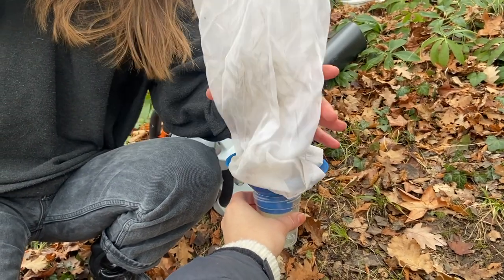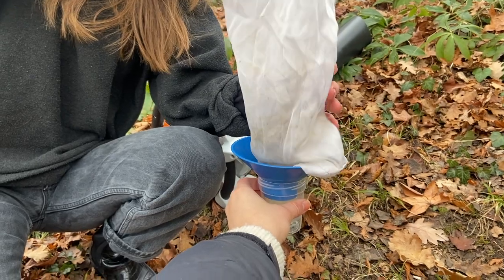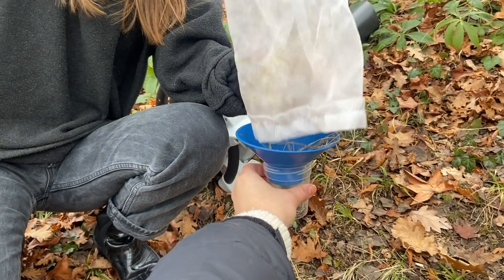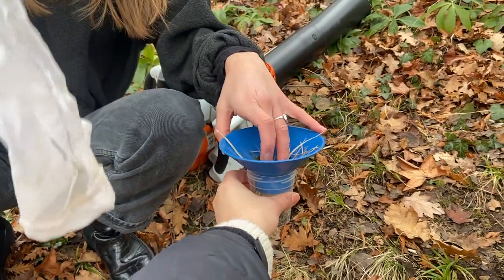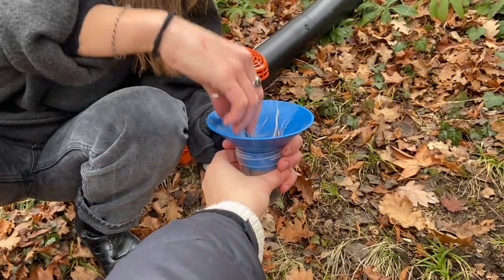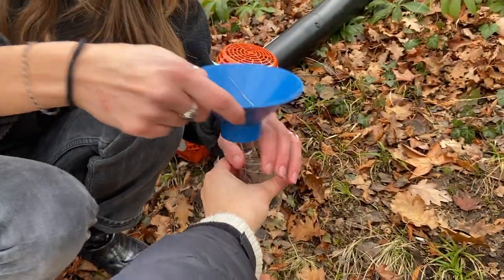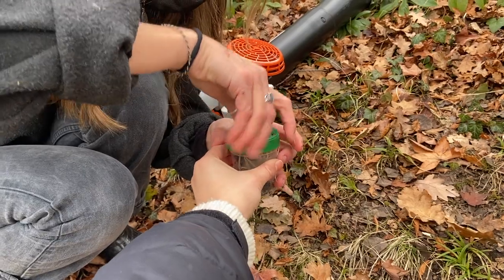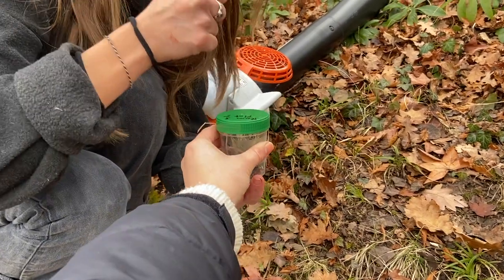Pour the insects into the ethanol, making sure that no ants or other insects that tend to crawl out quickly fall out the sides. Screw the lid back on, making sure you collect all of the insects to send back to us here in Byrne. Thank you.